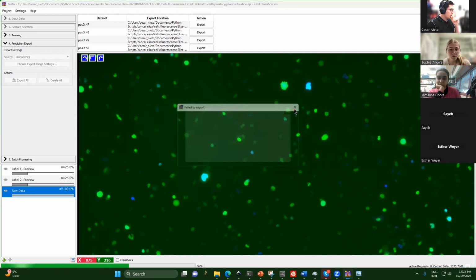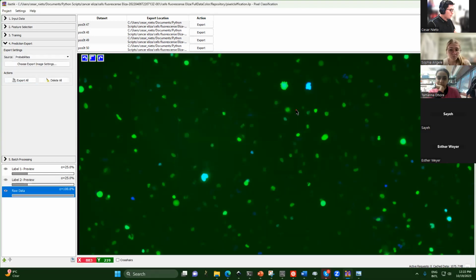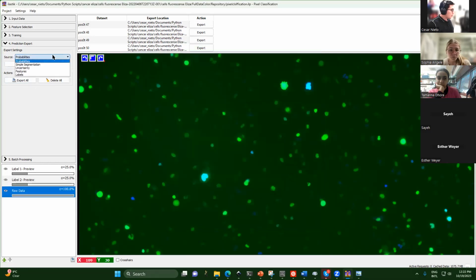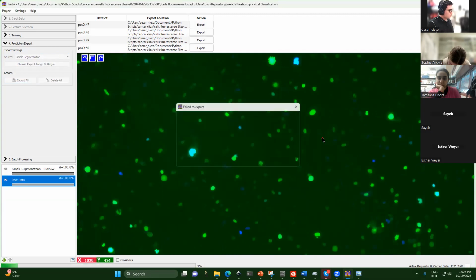I don't know what happened. Okay, I think here I chose to export probability. Let's see if it's a simple segmentation. Let's see what happened here. The same.